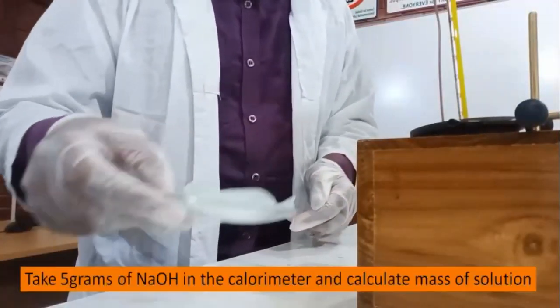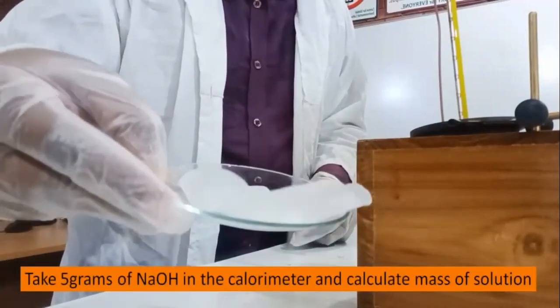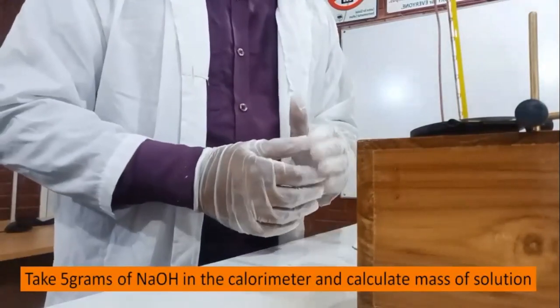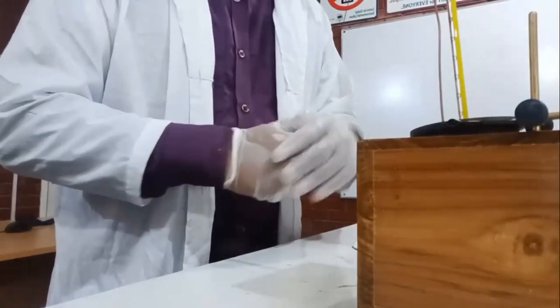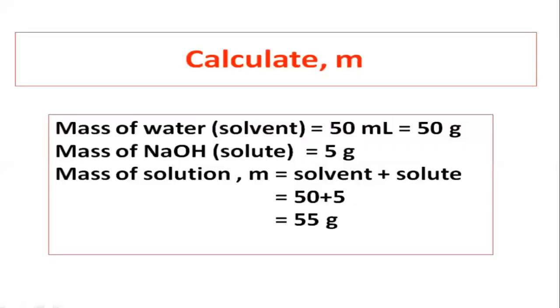Now I will take 5 grams of sodium hydroxide in the calorimeter. Already I have taken 50 ml water in the calorimeter. If I add 5 grams of sodium hydroxide to that water, what will be the mass of that solution? Mass of that solution will be 50 plus 5. It will be 55. So the value of M will be 55.